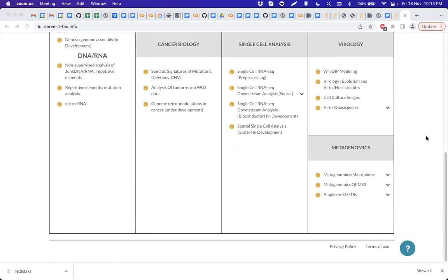So merging the sequences by their identity percentage, be it 97 or 99, that is OTU. But finding the probability of a sequence being 97% close to any other sequences, and if this probability estimation is not above the threshold, then those sequences are completely left out and considered noise, and hence you have amplicon sequence variants, ASVs, and you will get a fewer number of sequences participating in ASVs, but those ASVs will be very well defined.